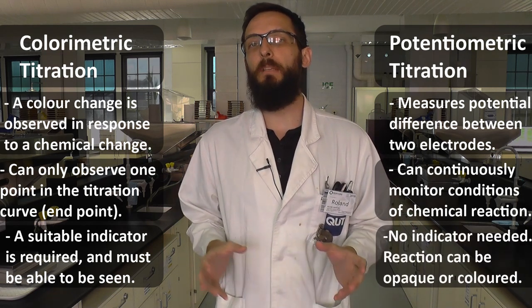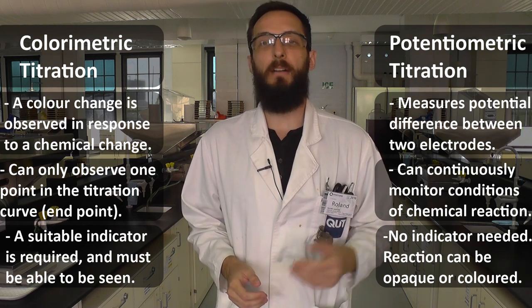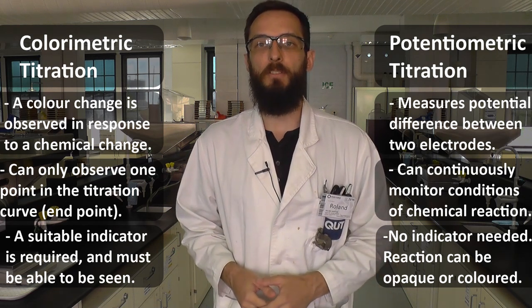In this experiment, we'll be investigating a variety of acids and bases of assorted strengths, as well as how a buffer is affected by pH changes. Let's get started.